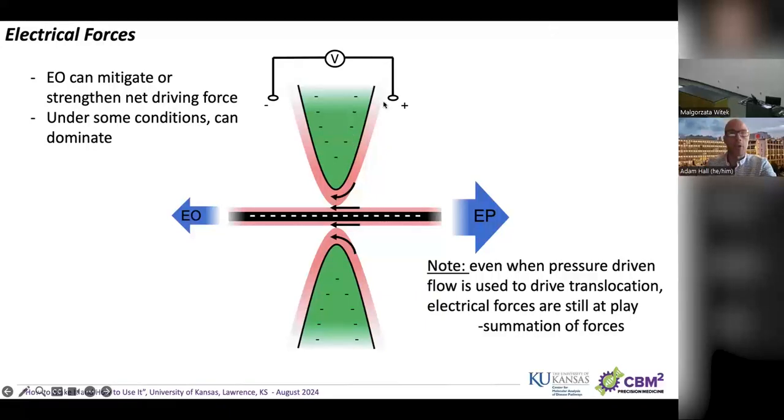All these positive charges are actually feeling the opposite force, so they're flowing towards the negative electrode. And when ions move through a liquid, they drag some of the liquid with them. That sets up something called an electroosmotic flow. So these ions moving this way will cause a net flow of fluid that counters the motion of the molecule going through the pore. As you can see, this is opposite to the direction of electrophoresis in this case, so it's going to counter the motion of this particular molecule.